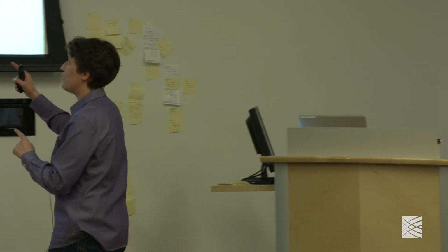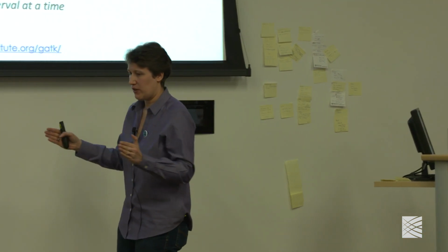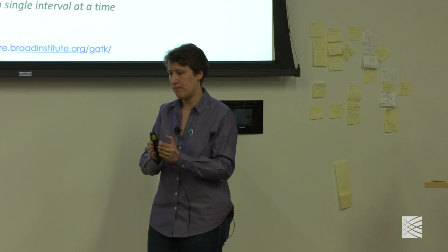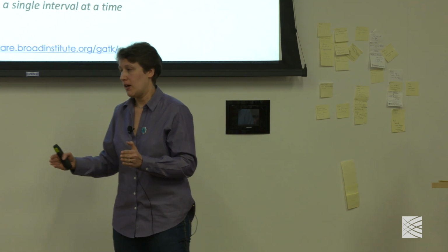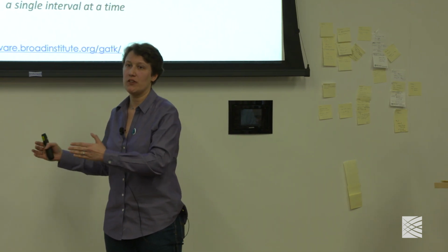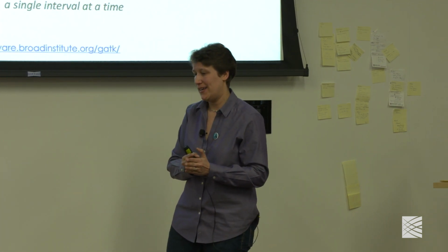What that means is that this tool was designed to only run on a particular interval and process the records that are within that interval. And that really has to do with how the code was engineered initially.